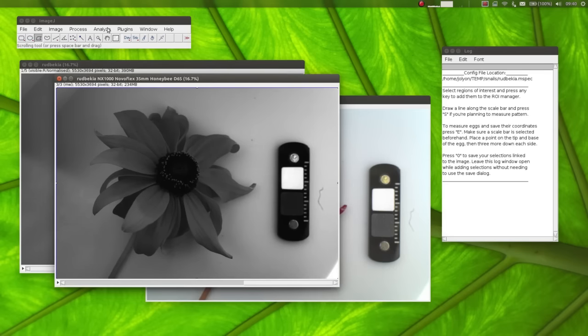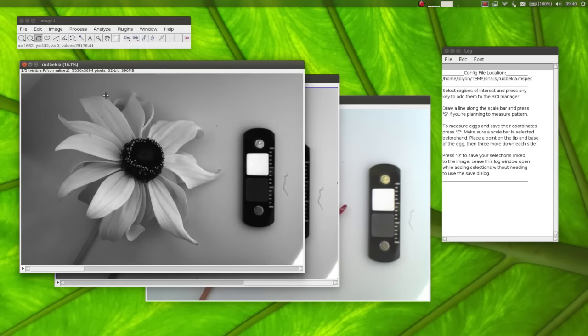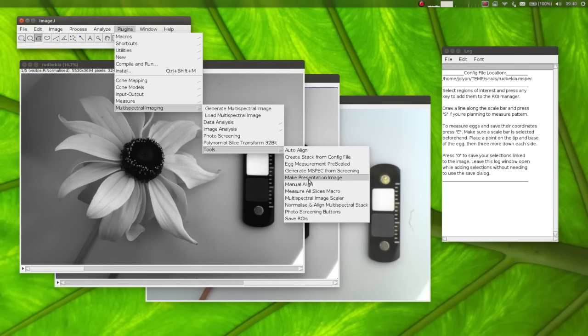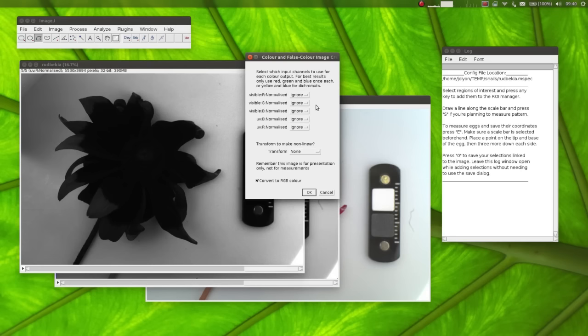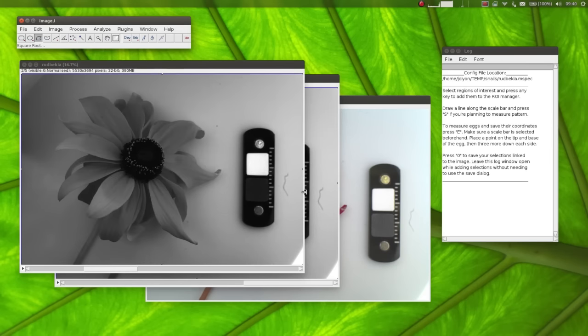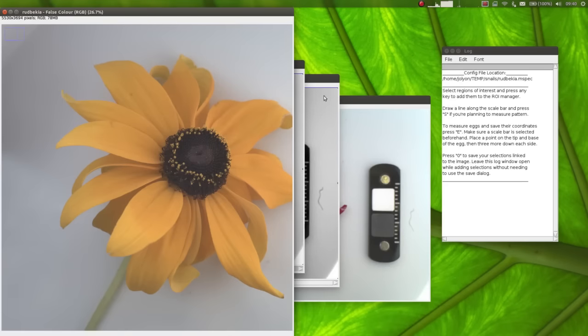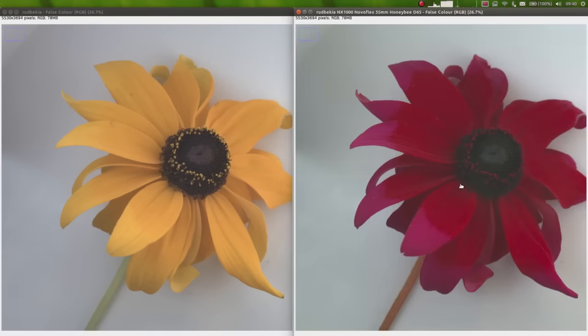I can convert this to human vision. If I just go to the normalized image here, I can again go Tools, Make Presentation Image. And I'll just use the basic camera vision in this case, which will roughly equate to human vision. So I'll select the visible red, the visible green, and the visible blue from the camera. So this is camera red, green, blue vision. And I'll do a square root transform. There we are. This is what it looks like roughly to us humans, and this is what it looks like to a honeybee.